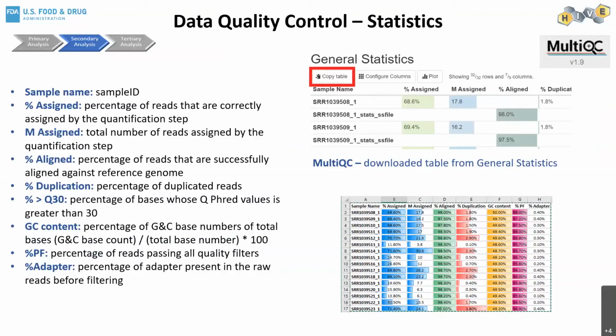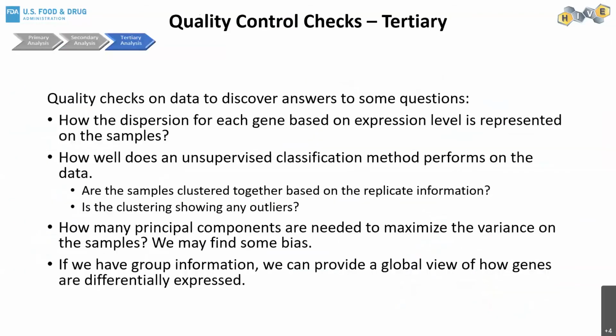Again, for data quality control statistics, there's a summary. We can download the table from the MultiQC. We can use it for our report, for the publication, to communicate to others, and not only with a graph, we can use it in a table format.